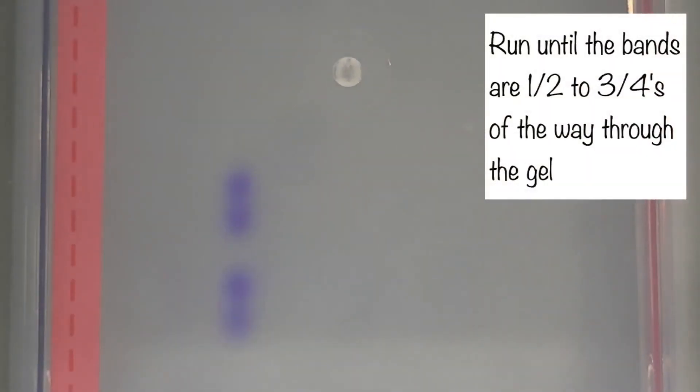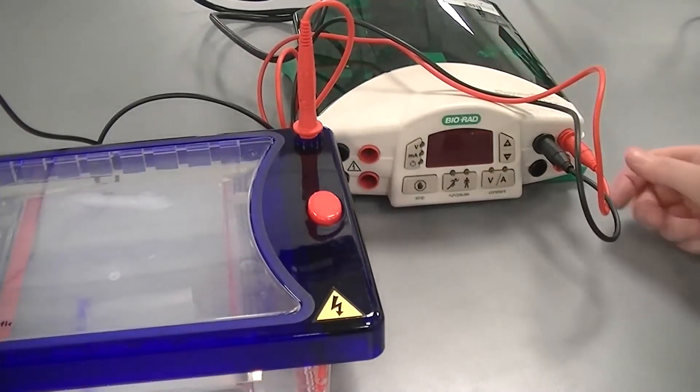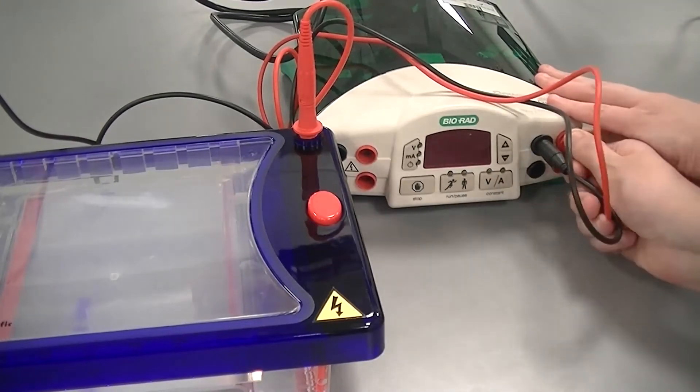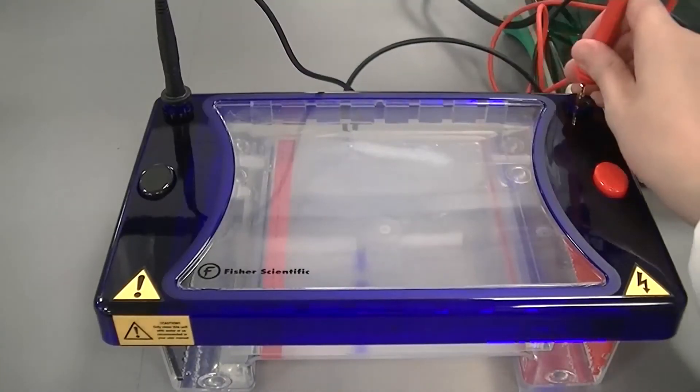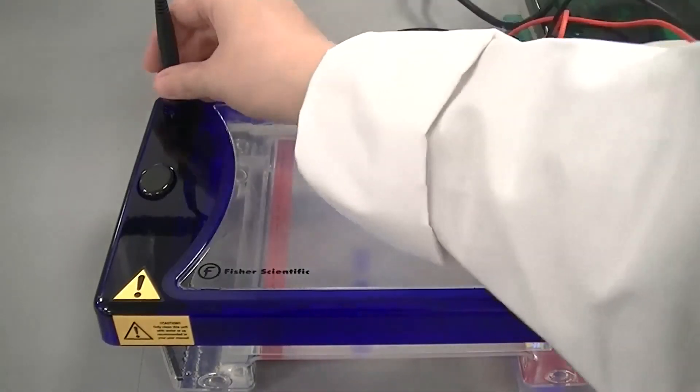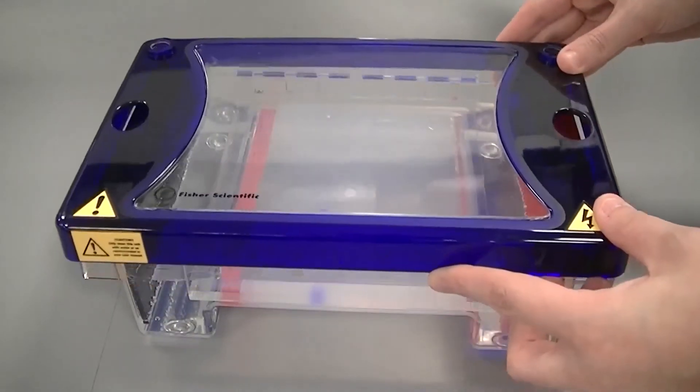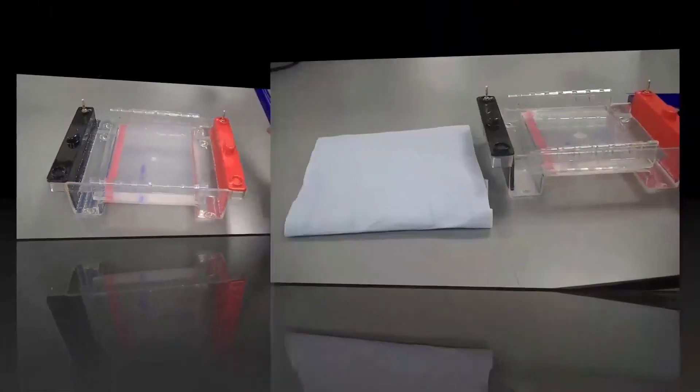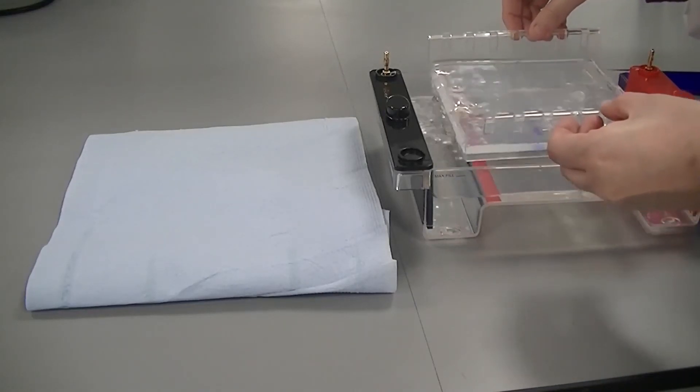When the gel is finished running, turn off the power pack and remove the wires. Carefully remove the lid from the gel tank. Lift out the casting tray with the gel and drain off any excess TAE buffer carefully. Then place on a paper towel. Your gel is now ready for imaging.